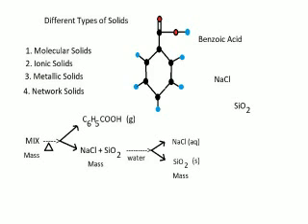Once we've weighed the petri dish, that includes both the sodium chloride and the sand at this point, we then have to get those two components apart. And again, the way we're going to do that is simple. We'll simply add water to the petri dish. The sand, of course, isn't going to care about the water. Network solids do not dissolve. But water is a very polar solvent, and so it's a good solvent for dissolving ionic compounds like the sodium chloride. So very quickly the sodium chloride will dissolve.